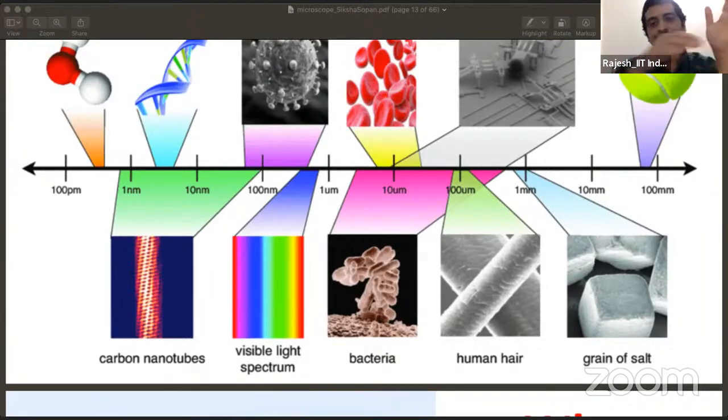Of course, flowing current will have a magnetic field, but a lot of things are taken care of, including vibrations, and to nullify these magnetic fields, whatever little is created. All these are taken care of, and they don't disturb the imaging through the electron microscope.